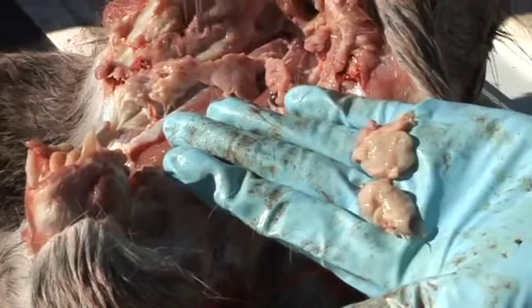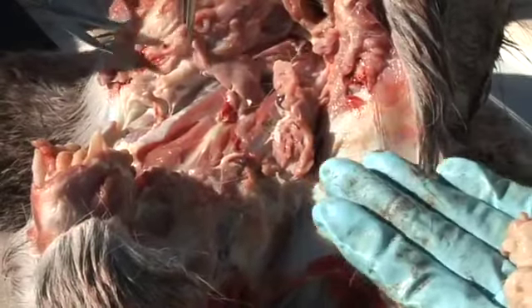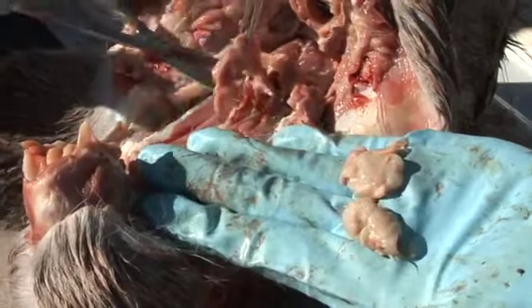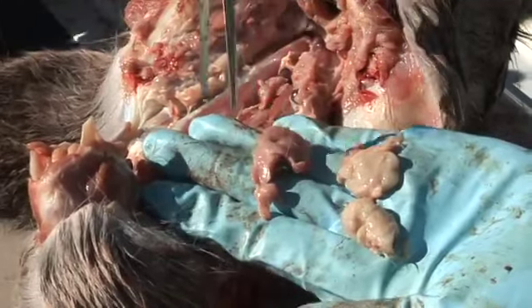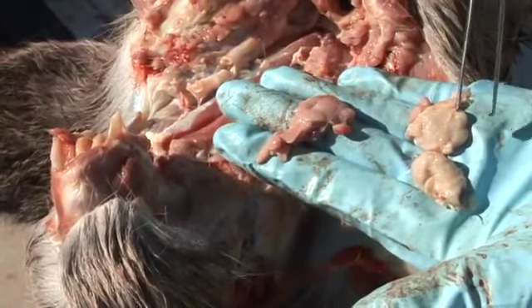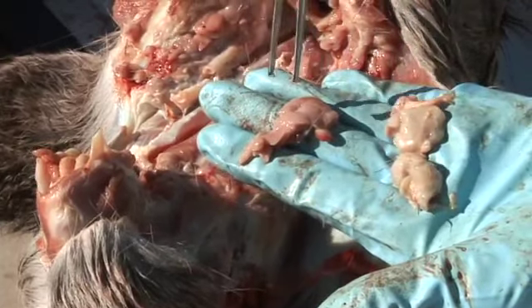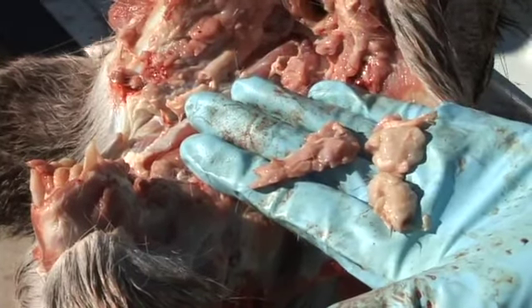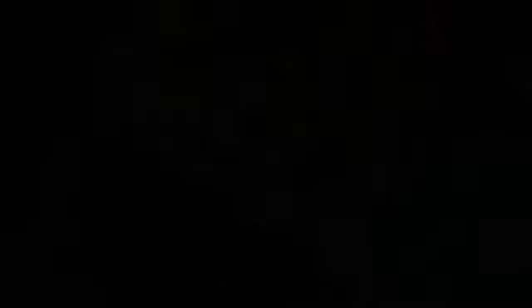Salivary gland is again removed for comparison. A special note: when animals die of hemorrhagic diseases, traumatic deaths, or if tissues are not fresh, the lymph nodes may be darker. If this is the case, the best way to identify the lymph nodes is by their firmness compared to the surrounding soft tissues.